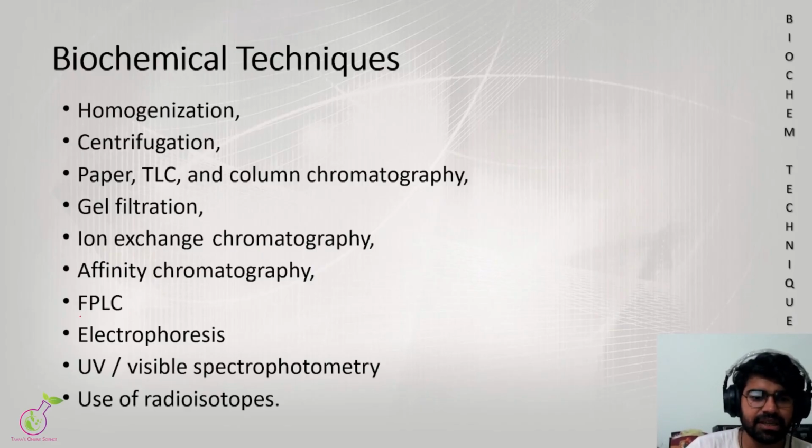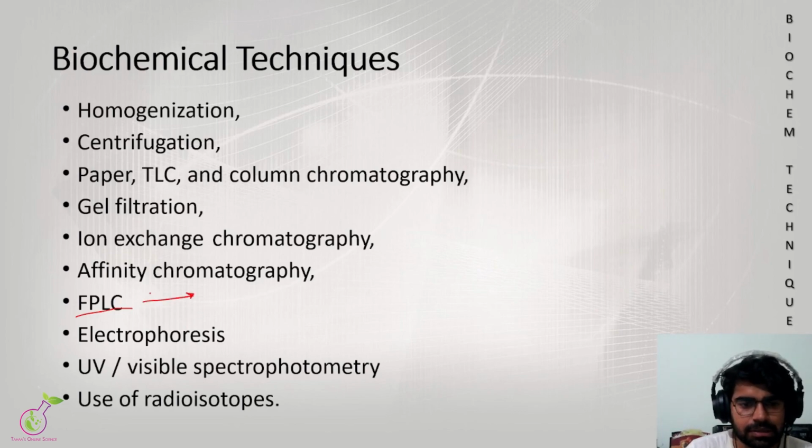So our next technique is FPLC. We will study this technique later in our subsequent lectures. So the next technique is electrophoresis. Electrophoresis is basically used for separating DNA on the basis of its size.